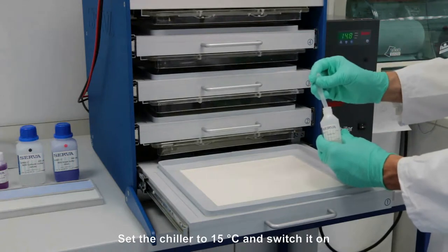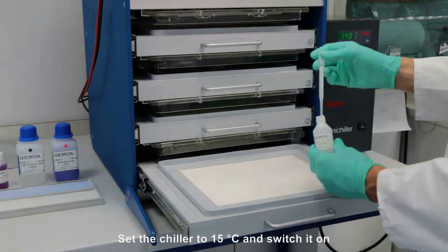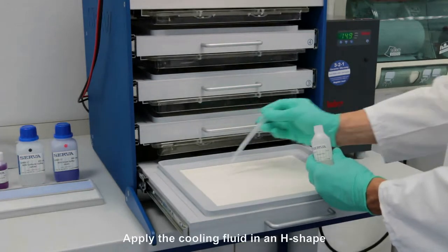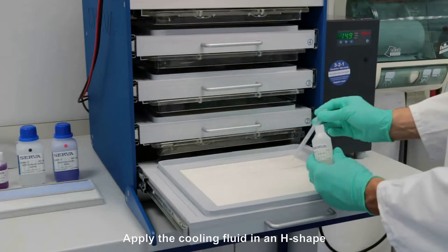Set the chiller to 15 degrees Celsius and turn it on. Apply the cooling fluid on the cooling plate in an H shape.